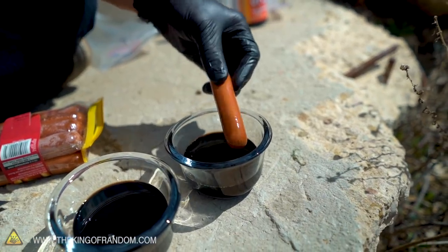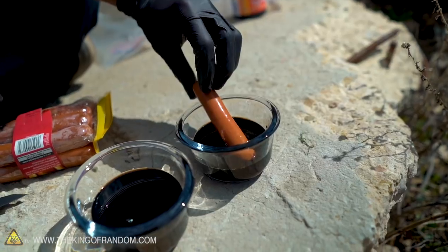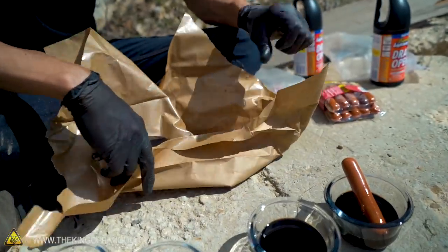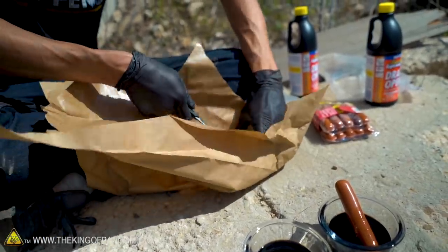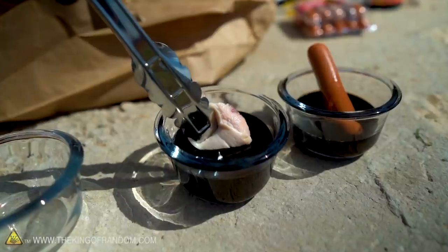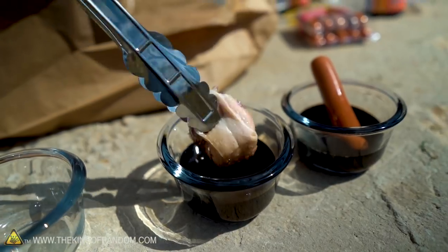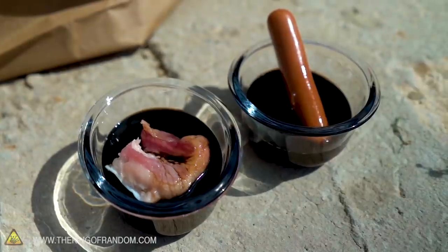It doesn't look like it's done too much. It does seem like it smokes when I first put it in. For this other jar, I'm going to take a little bit of pork belly, cut a piece off, and let it rest right in the acid. We're going to let both of those sit in the acid for a little while and see what it does to them.